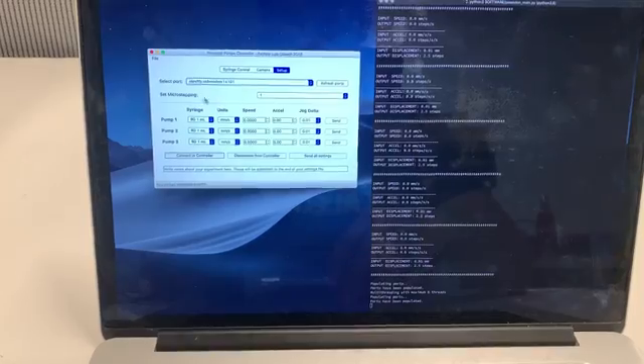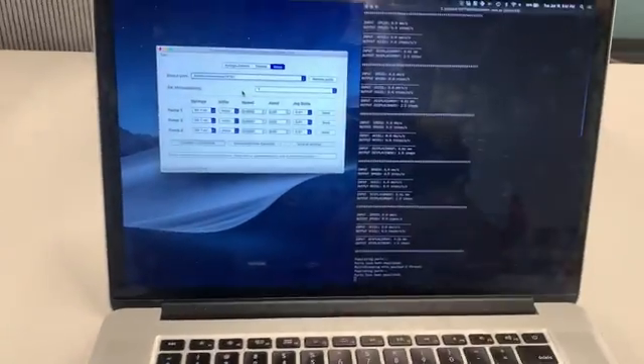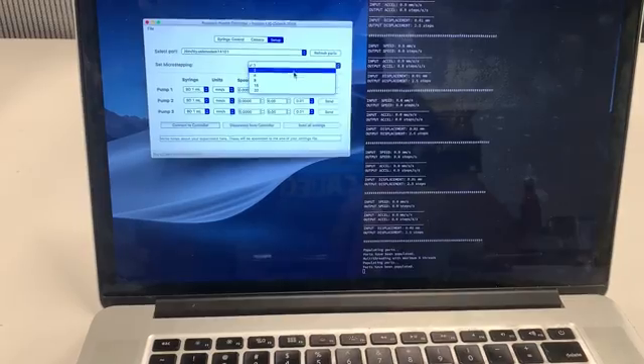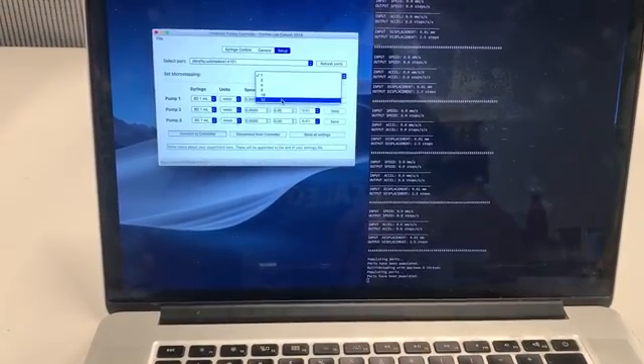The next thing I want to do is set the microstepping in software to match the hardware microstepping. It's very important that these two are the same, otherwise you're going to get inaccurate flow rates. You have an option for one, two, et cetera. In my case I'm using one. If I were using one over 32 microstepping, I would simply select 32.